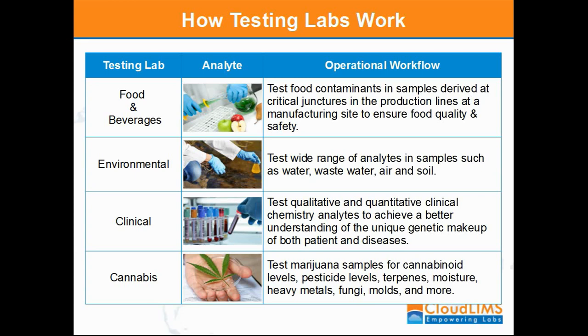Talking about the cannabis industry, its legalization for medical and recreational use across the United States and several other countries has led to an evident climatic surge in demand for cannabis testing facilities. With such increasing demand, there will be incremental test requests for cannabinoids, pesticides, terpenes, moisture, heavy metals, fungi, molds, and many more.